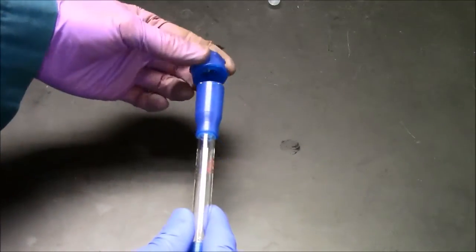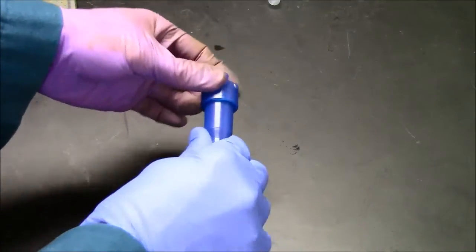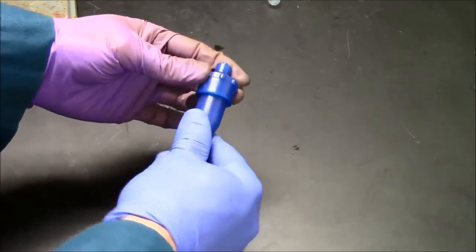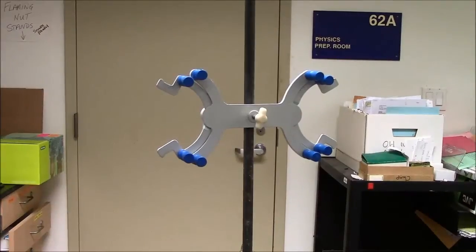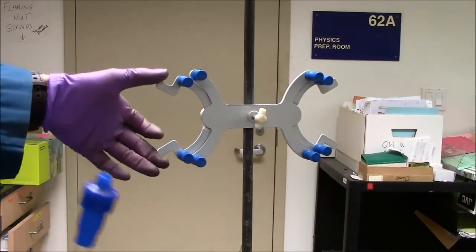This lid, similarly, will attach to the top of the column, and again, quarter turn, tight. These columns can be clamped to a burette clamp fairly easily.